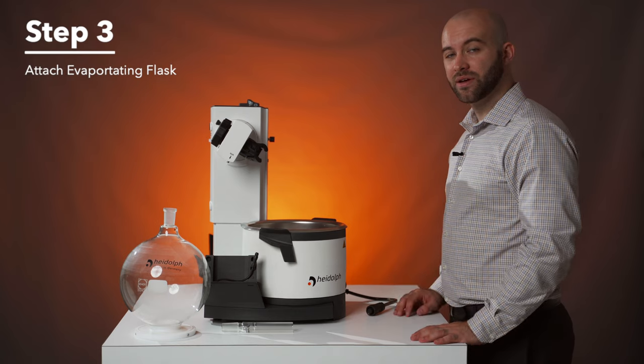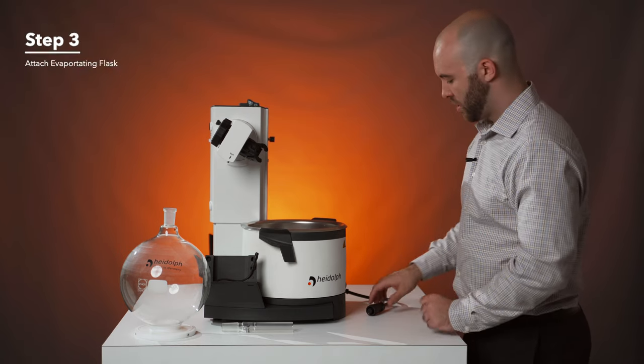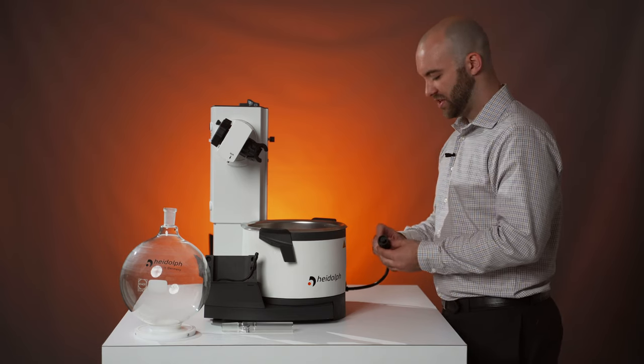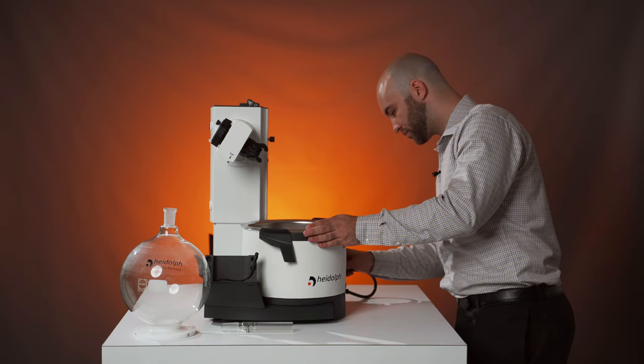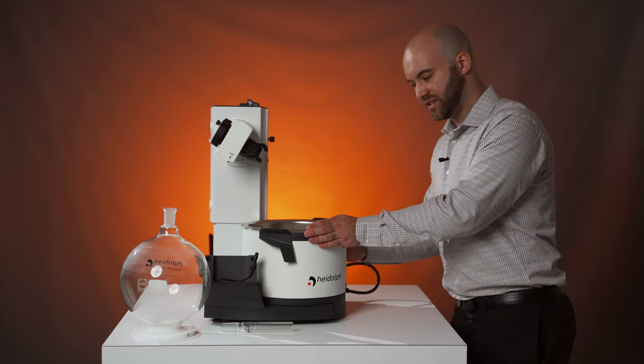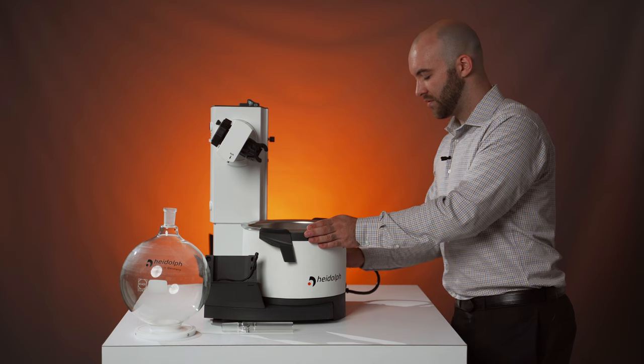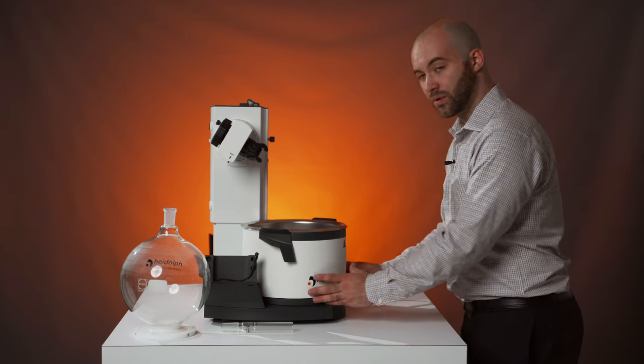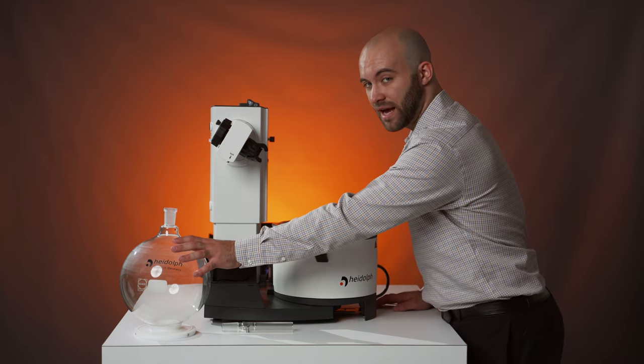Step three, we're going to add the evaporation flask to our HiVap. While we're here though, we're going to first attach the HiVap itself to the heating bath using this IP67 screwing cable. It slots right in the back here, lines with notches, and can be screwed on fairly easily. That is so at any time you can remove the bath for filling and emptying. Once that's been screwed on, I'm going to pull the bath out a little bit since we will be using a five liter flask.